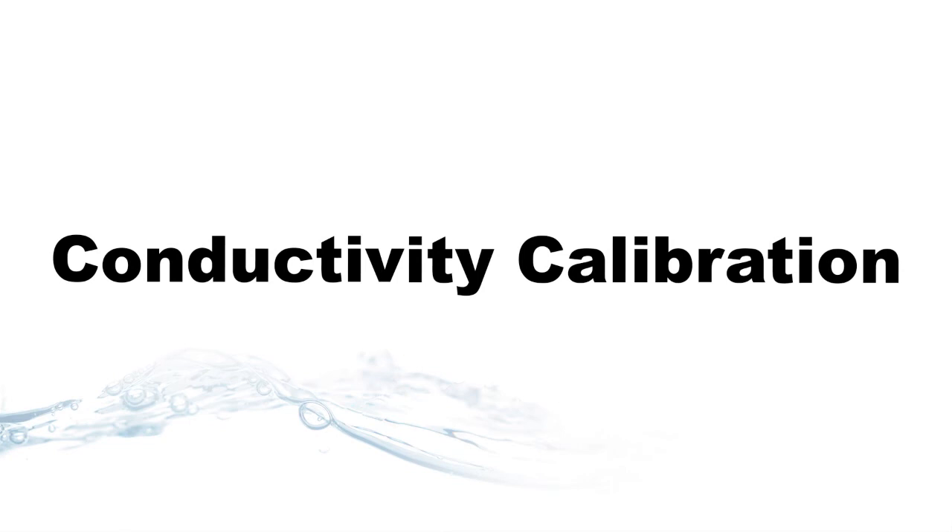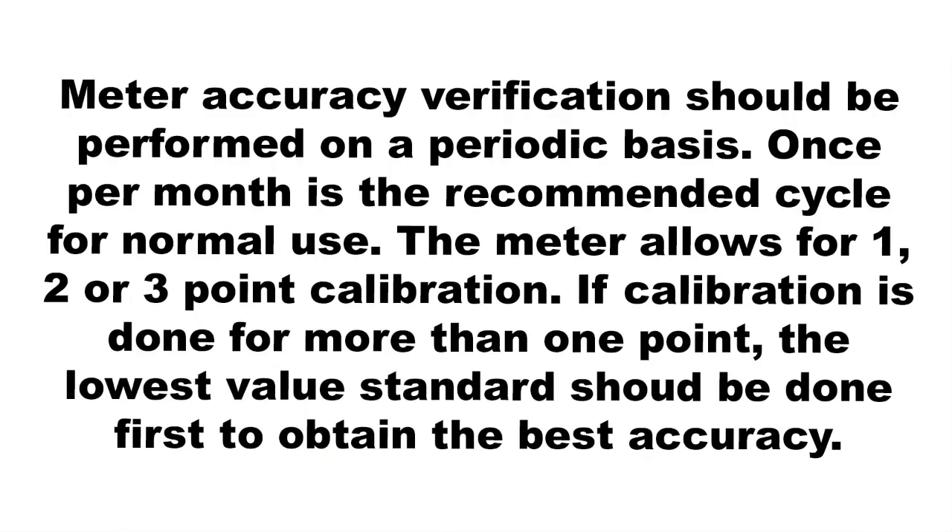Conductivity calibration. Meter accuracy verification should be performed on a periodic basis. Once per month is the recommended cycle for normal use. The meter allows for one, two, or three-point calibration. If calibration is done for more than one point, the lowest value standard should be done first to obtain the best accuracy.